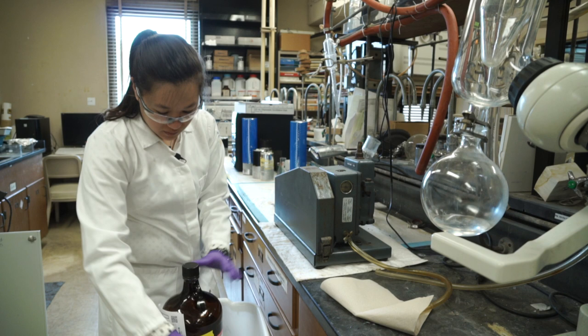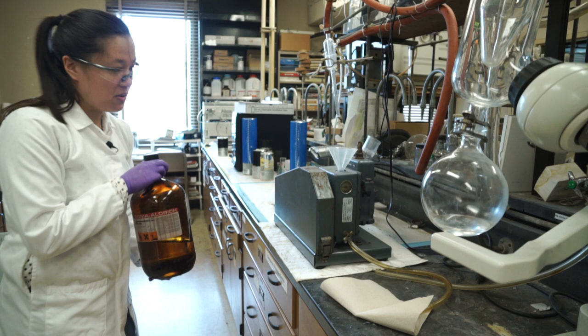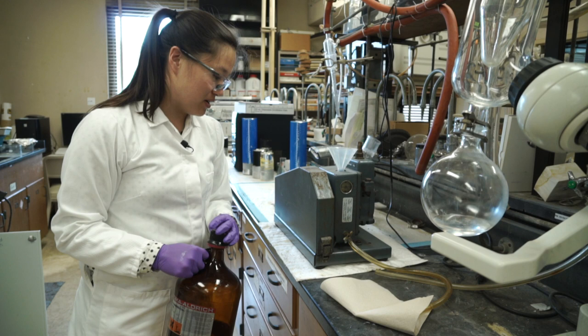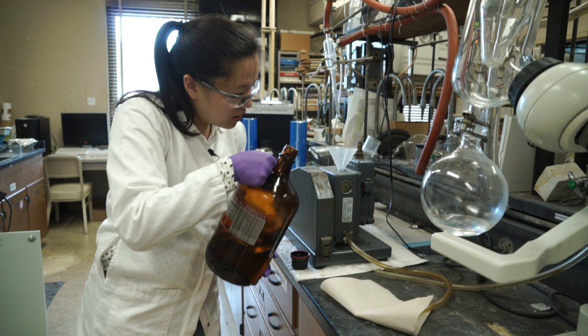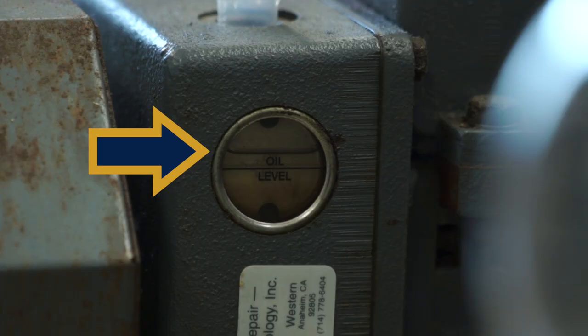We do need to refill it with some clean pump oil, which we also conveniently just keep in another 4-liter container. Make sure you keep them separate, so you don't accidentally pour waste oil into your drained pump. You'll know you're at a good level on the oil level line — you want to go just a little bit past it.